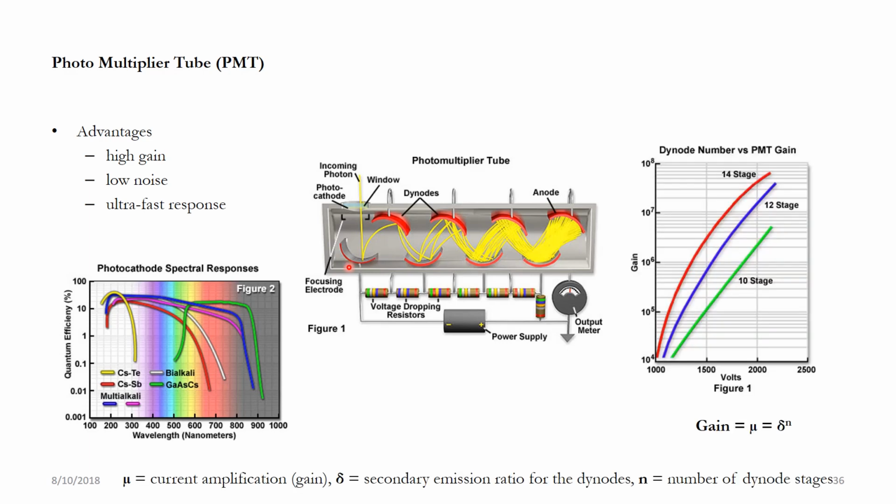But the gain that you can achieve using these kinds of detectors can be as high as almost 10 to the power 8, which is like millions and billions, a very big number, right? So these are mainly used because of their fast response. Say suppose you are trying to image one molecule in a very tiny volume, this is a great detector for that kind of purpose, or for doing an entire field imaging really fast.